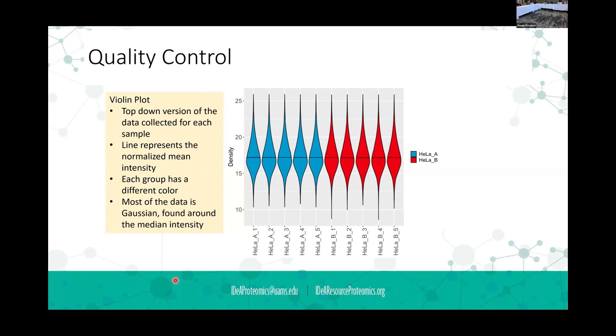Let's say you're doing a pull down in two different cell types, a wild type and a knockout, and you're pulling out something. Well, the fact that you've got a wild type and a knockout may be changing the protein distribution in that group. And we actually had this occur at one point.